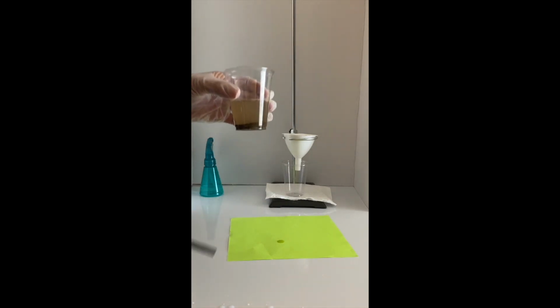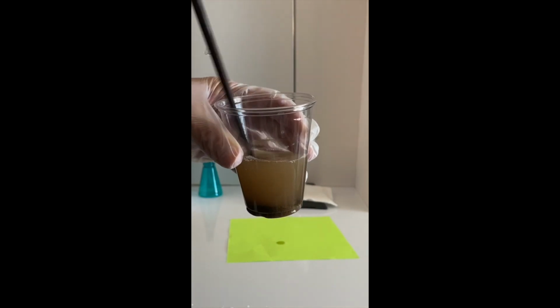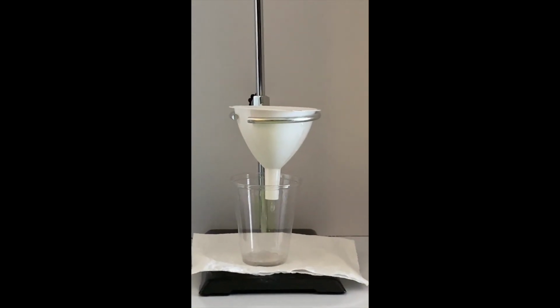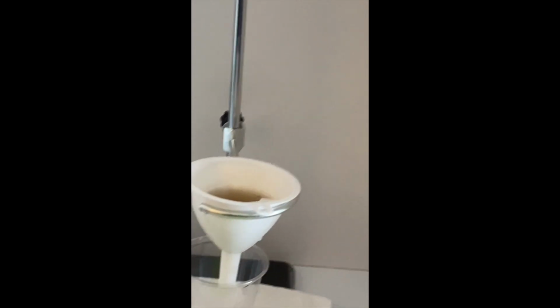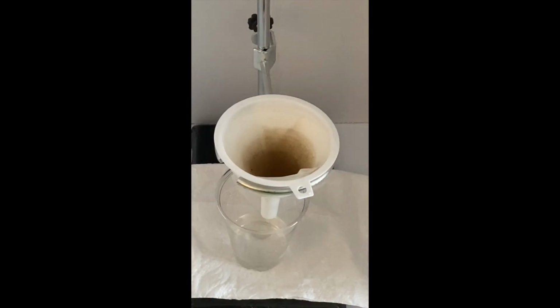Now it's time to pour the suspension through the filter paper, but I will stir it before doing so. Notice how dirty the water looks. The suspension is carefully poured into the filter paper. Notice that the water passing through the filter paper contains no dirt particles. It appears colorless and transparent or clear compared to the dirty water mixture inside the filter paper in the funnel. The liquid level in the filter paper gradually decreases with time.